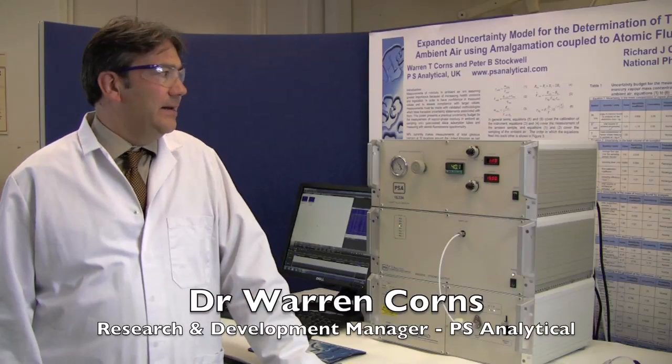Hello, my name is Dr. Warren Corns. I'm the Research and Development Manager from PS Analytical and I'd now like to talk about our system of how to determine mercury in gases.